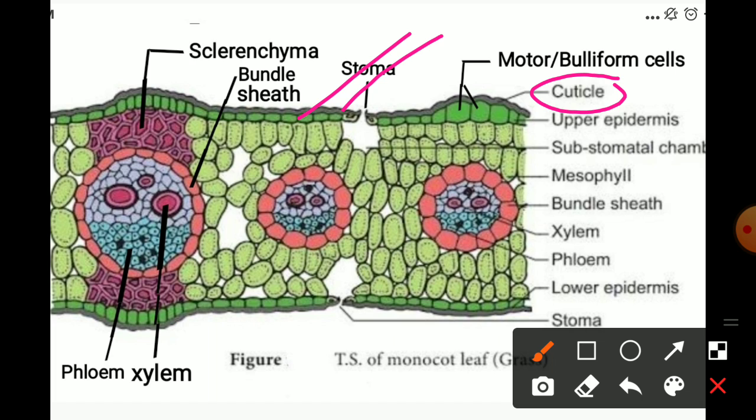This epidermis is made up of barrel-shaped or dumbbell-shaped, cylindrical cells, which are compactly arranged and of usual rectangular size. This region shows, at certain places, very large balloon-like cells.